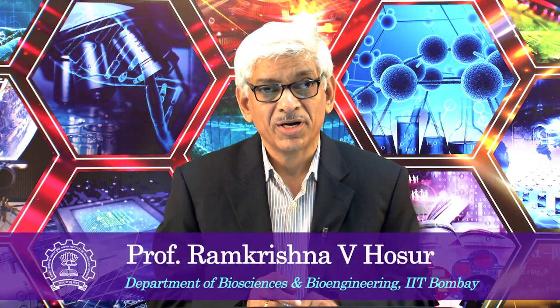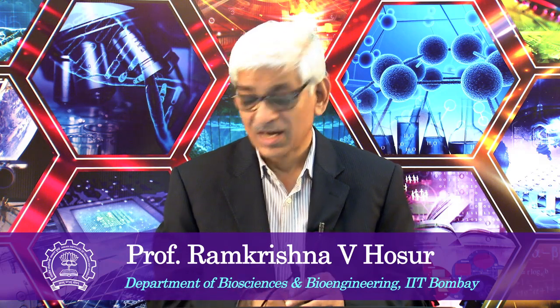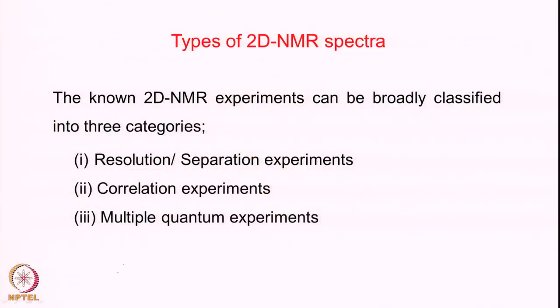So we are now going to discuss the various two-dimensional NMR experiments that have been developed over the years. A large number of experiments have been developed, and these are generally categorized into three groups: resolution or separation experiments, correlation experiments, and multiple quantum experiments. Multiple quantum experiments are a very unique feature of two-dimensional NMR spectroscopy.